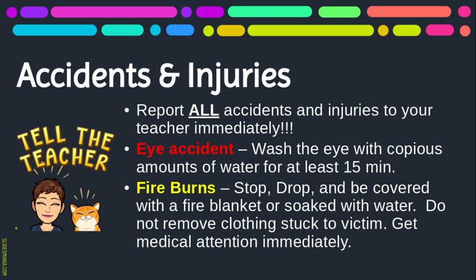Accidents and injuries. Report all accidents and injuries to your teacher immediately, no matter how small they are. I am somebody who has a boatload of allergies, and I learn new allergies that I have all the time. So if I poke myself in a science lab when we're working with chemicals or something, I always make a mental note so that if I have some kind of allergic reaction, I can connect those two. So, no matter how small it is, let me know.